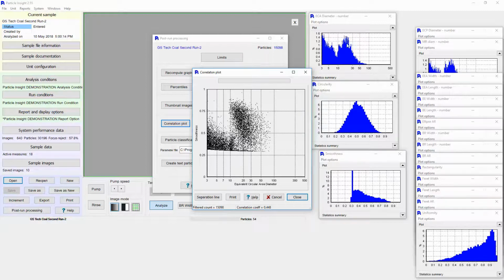So we see here in size, this is actually very interesting. Here in size, there are two distinct populations. There were some very small particles, by the way, below 3 microns. And there were a few big, very large particles. The way we can see the large particles is by volume and not a number weighted distribution.